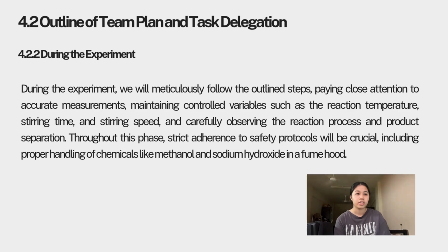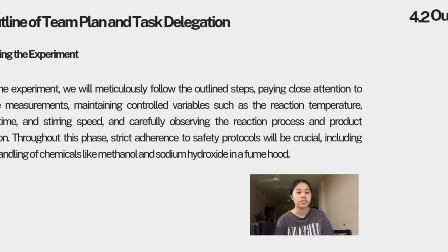product separation. So throughout this phase, we will follow the safety precautions, including proper handling of chemicals like methanol and sodium hydroxide.